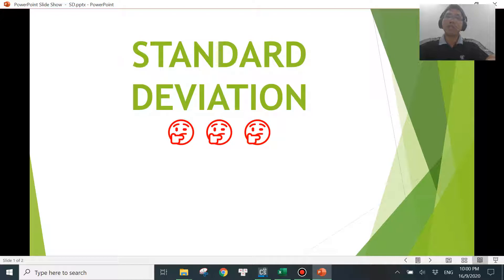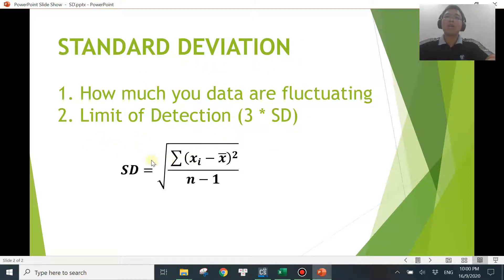Standard deviation is a very useful term in two ways I can think of. The first one is it will tell you how much your data is fluctuating, and the second one is you can use it to calculate your limit of detection.